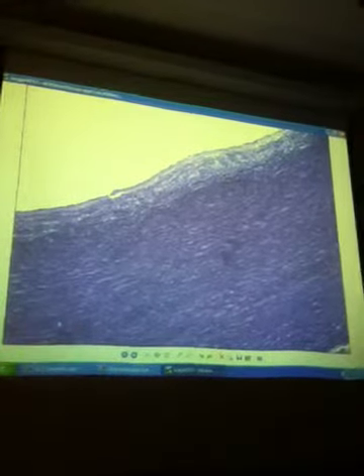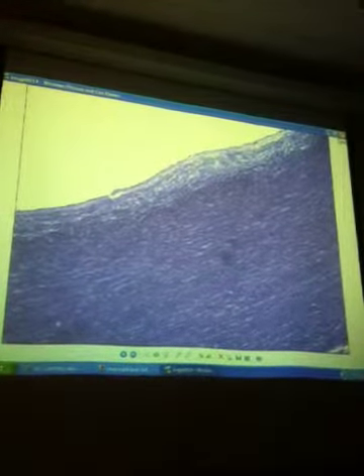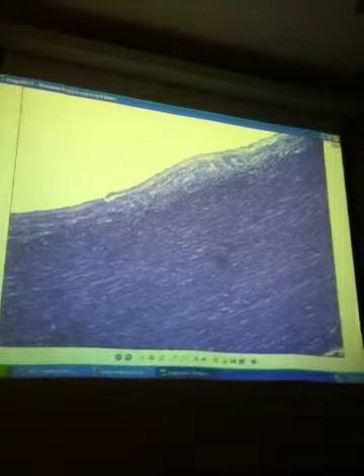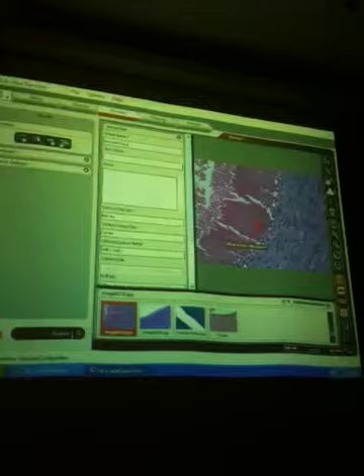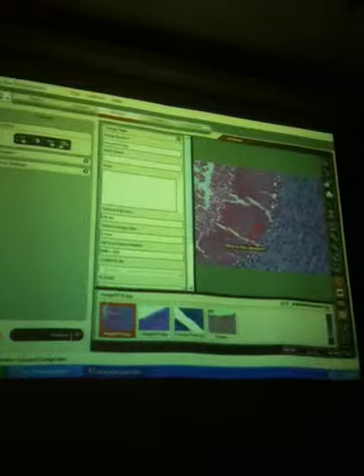Make sure you look at both the aorta slide and the regular artery and vein cross-section. Make sure you can tell the difference between an artery and a vein, the different tunica levels, and then on the cross-section that you can identify the elastic layer. It should just look like a ruffle.